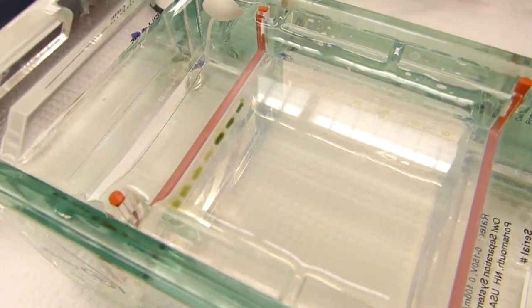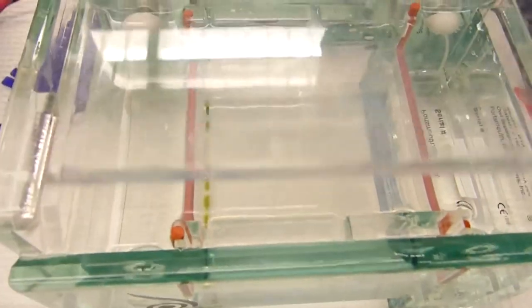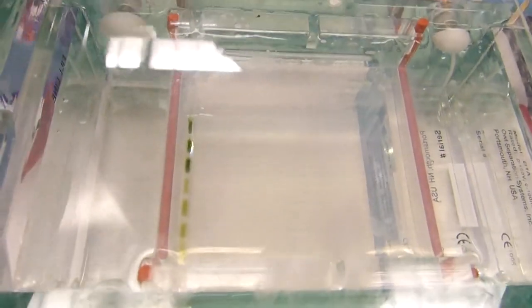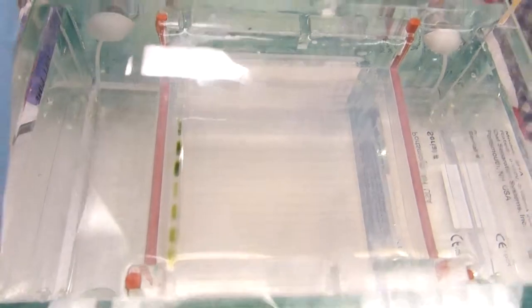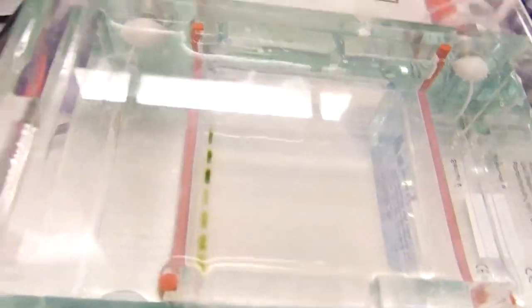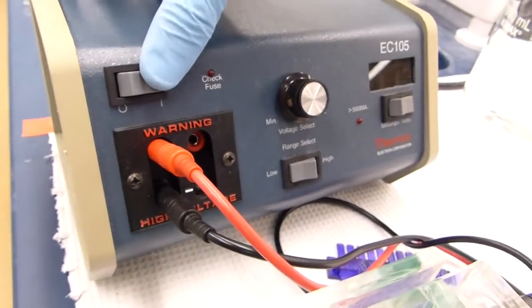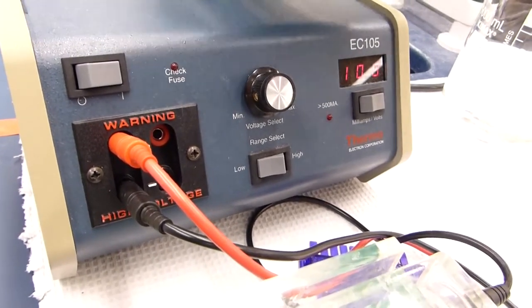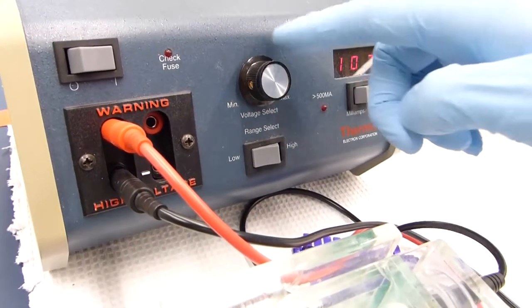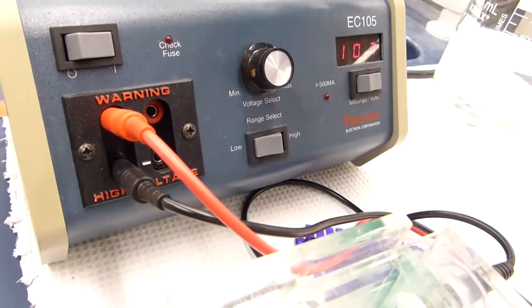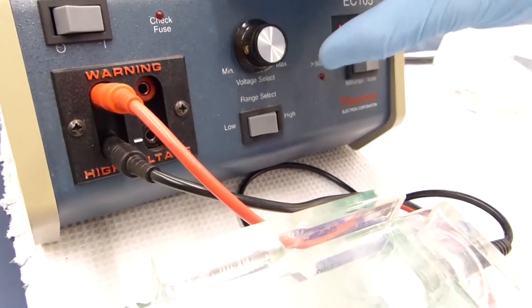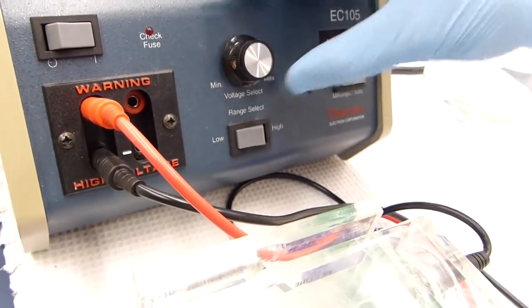Once you have placed your last sample in the gel, you want to slide the cover of the gel lid on so that the red and black nodes slide into their spots and are fully connected. From there you want to turn on the gel electrophoresis machine and set the electricity to whatever setting you need for the time that you want it to run.